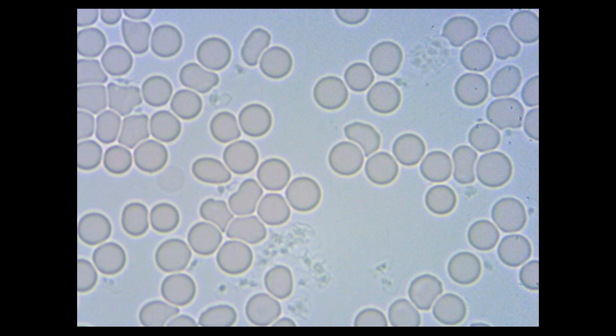I see, thank you. And does dark field play a role in your choice of camera as well? Well, yes, it does, and also just the fact that you're viewing samples in both dark field and bright field. To do this, the camera needs to be able to adjust its exposure properly between bright field and dark field. Now, this is not always achieved by the camera automatically. So often one would need to adjust these settings in the camera's software. And this is then another factor to consider because some cameras don't have the most user-friendly software available.